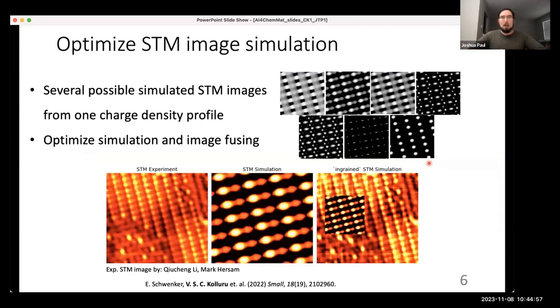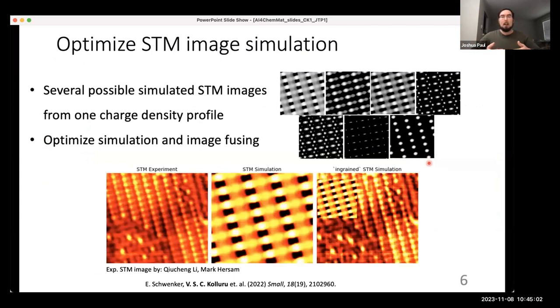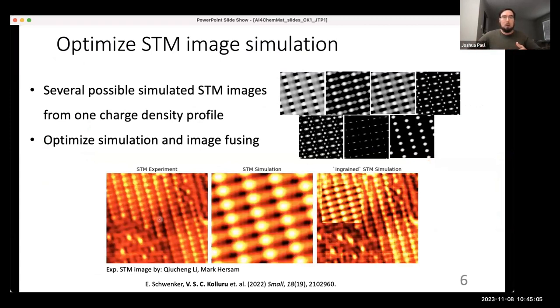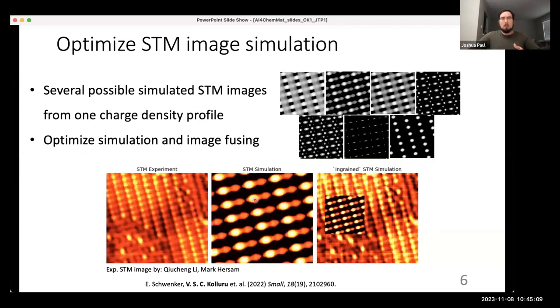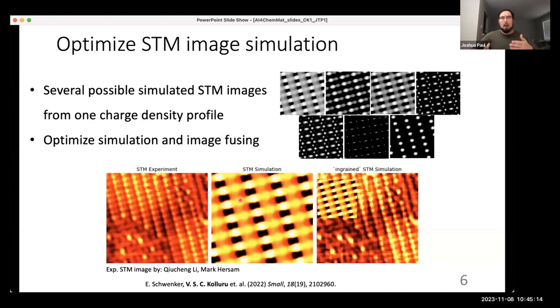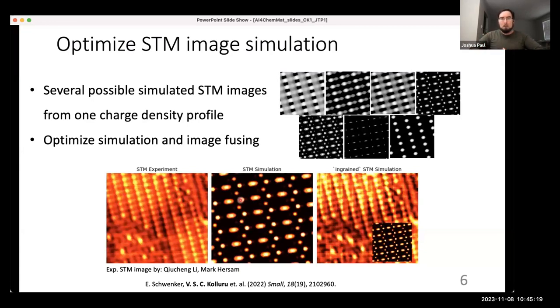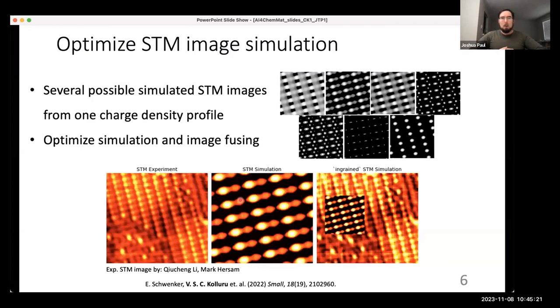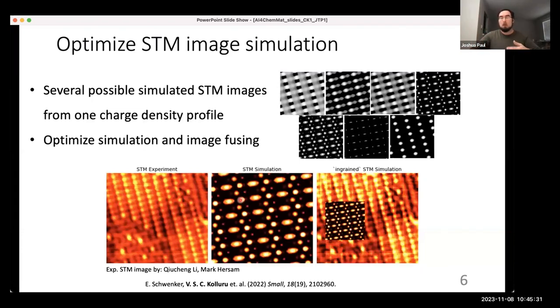A match is made against the experimental image, and a new score is generated identifying the amount of mismatch between the experimental image and our theoretical STM simulation. And you see here the Ingrained software passing through at the beginning, not so great a guess, but it starts to move around, converge, and eventually get a pretty good fit. Then we end up having a final Ingrained-STM simulation overlaying the theoretical and the experimental, so you can see just how good those results end up being.